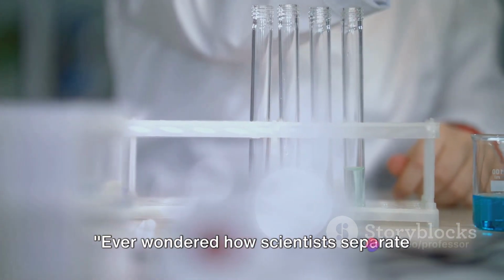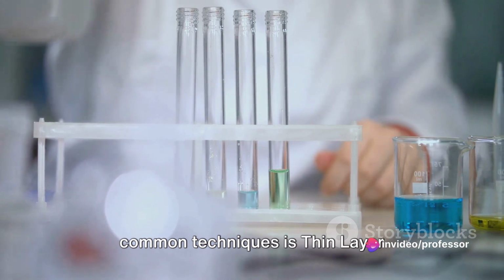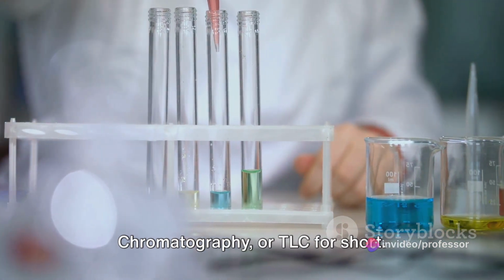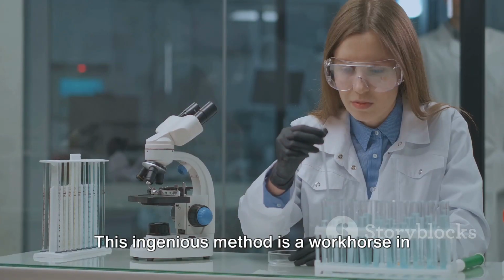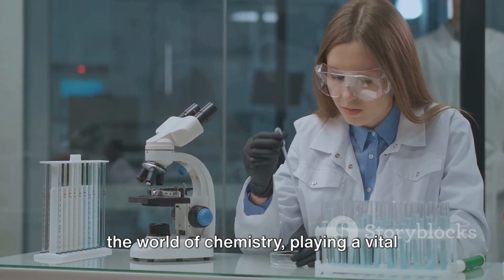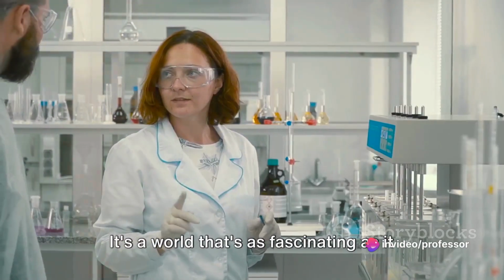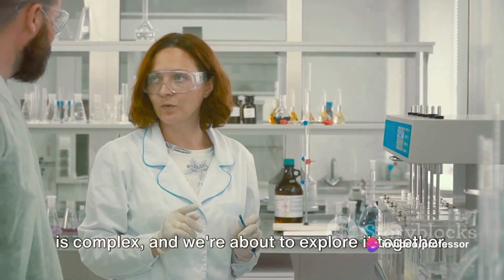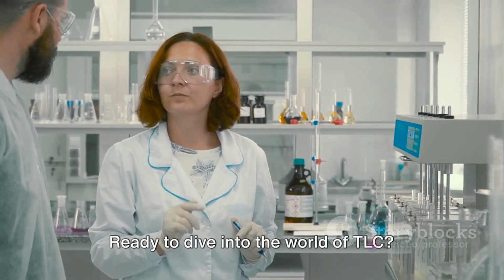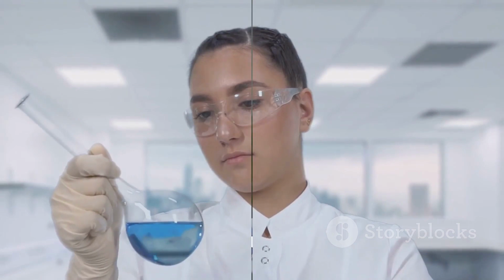Ever wondered how scientists separate mixtures in the lab? One of the most common techniques is thin layer chromatography, or TLC for short. This ingenious method is a workhorse in the world of chemistry, playing a vital role in everything from pharmaceutical research to food safety testing. It's a world that's as fascinating as it is complex, and we're about to explore it together. Ready to dive into the world of TLC? Buckle up, because here we go.